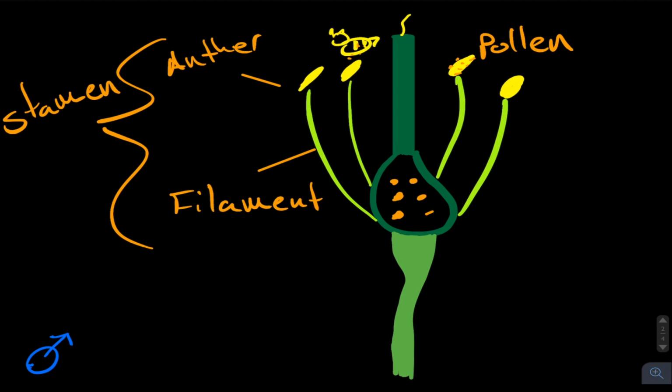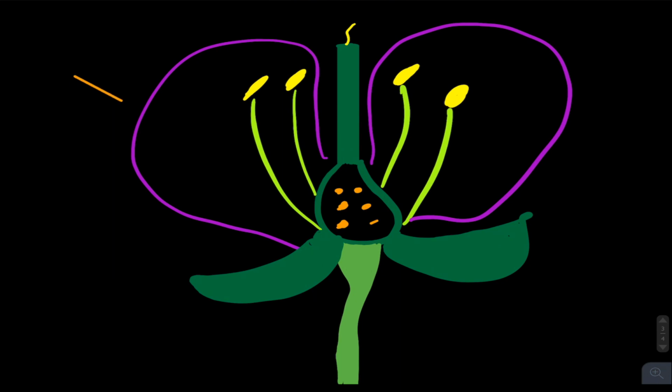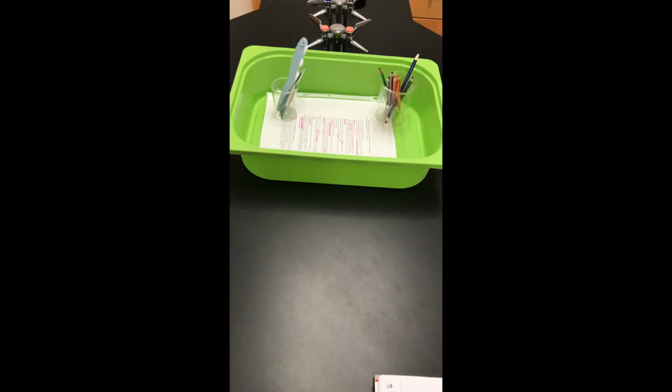So here are our male parts of our flower. So we do have male and female parts. And lastly, we can look at our bright and beautiful petals. These are going to be important when we want to attract pollinators to our flower. And if, say, there was a weather event, or maybe this is nighttime and we don't want to be bloomed, we can protect our petals with what are called sepals. And these sepals sit at the base here of our flower.